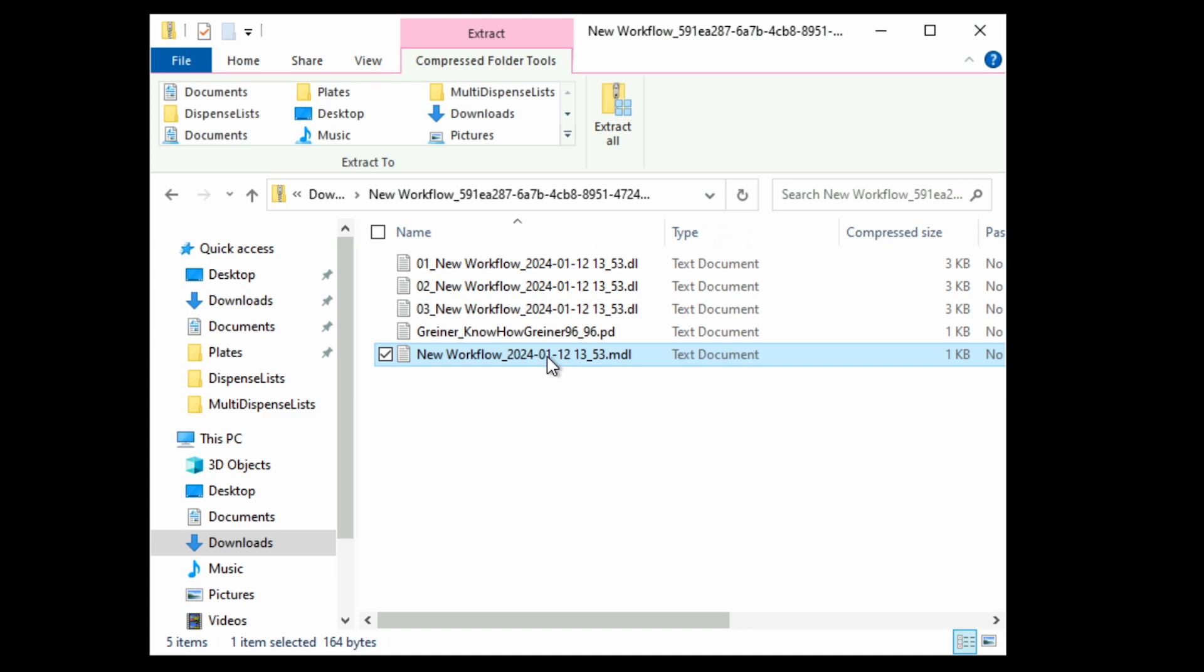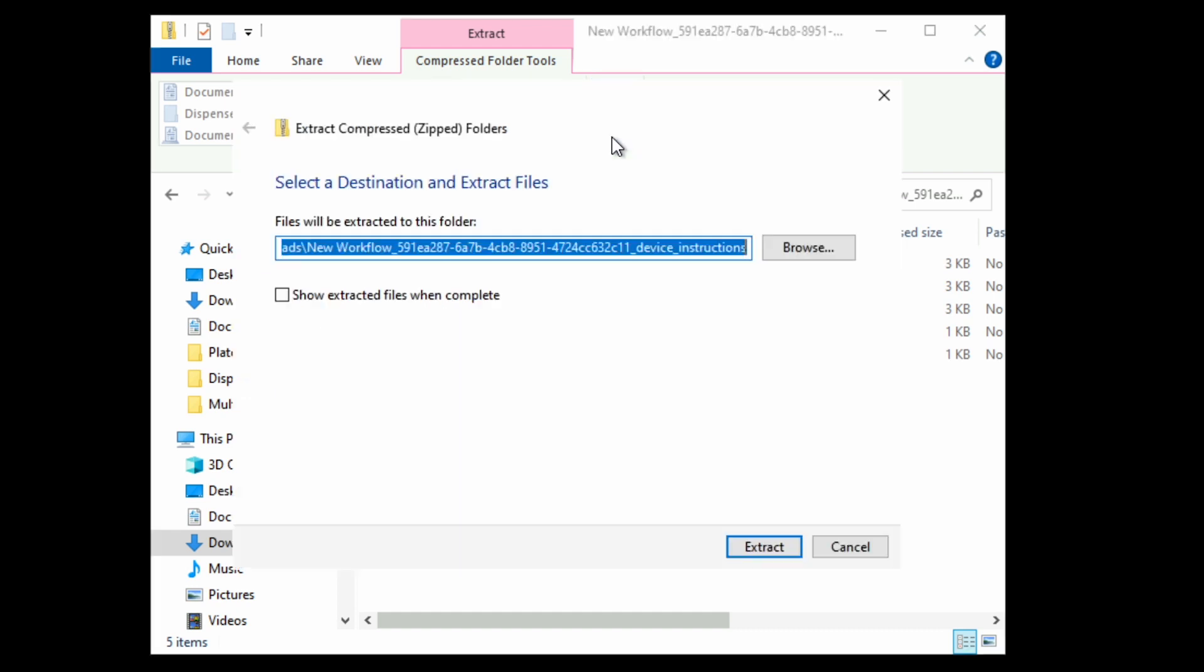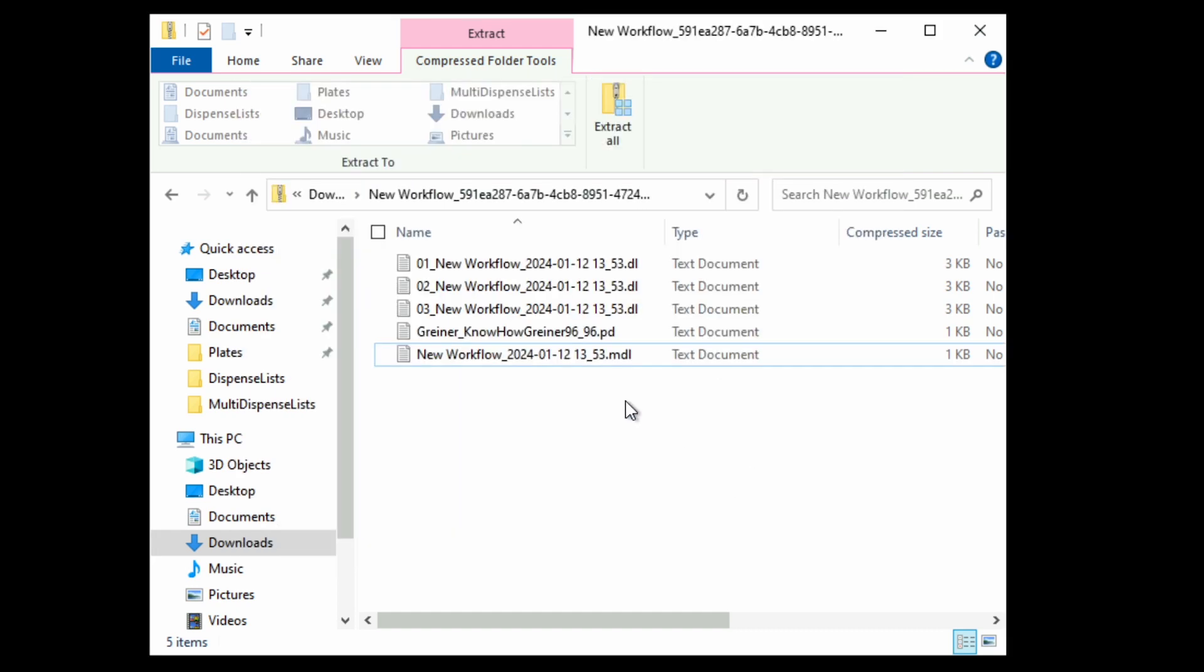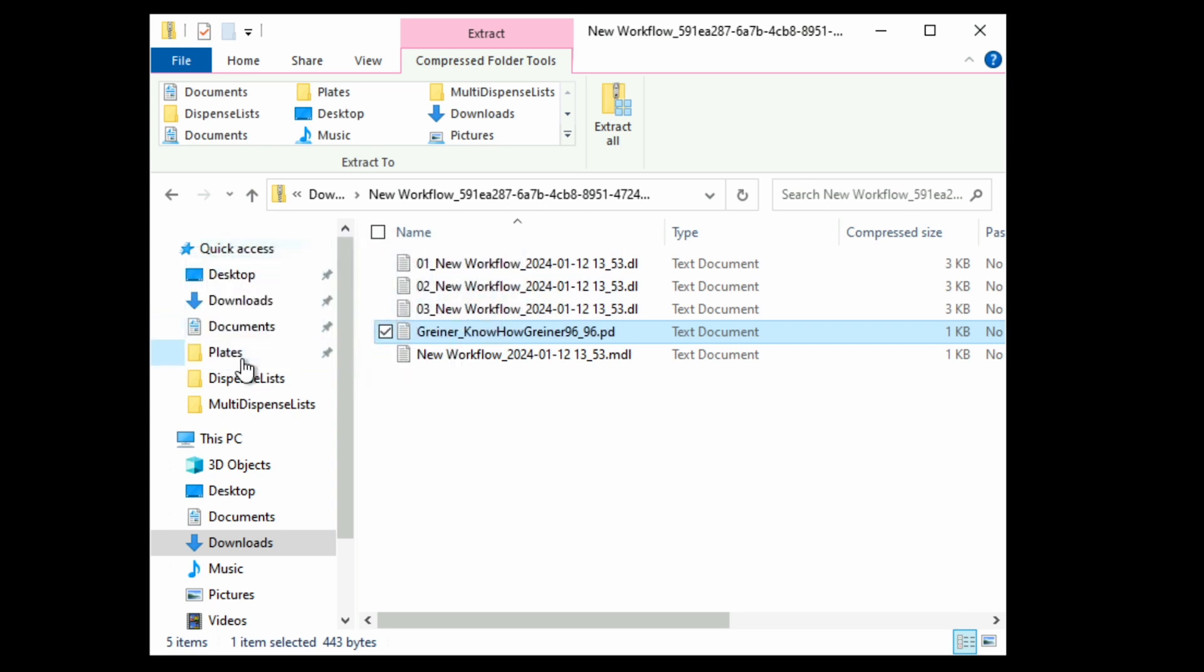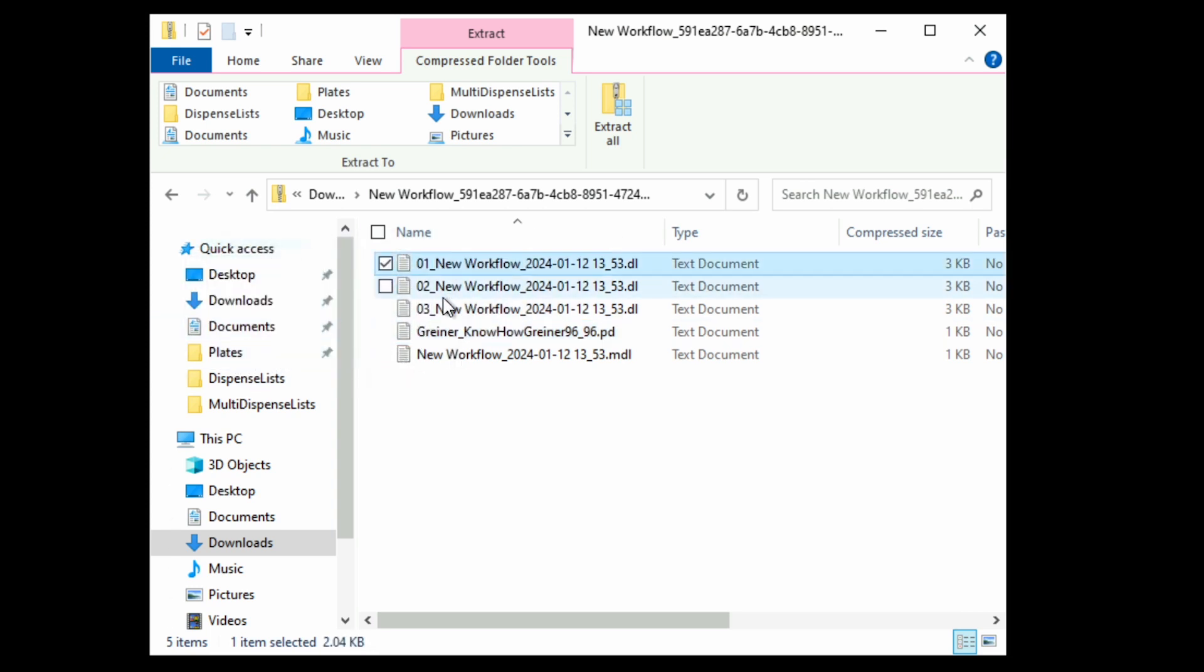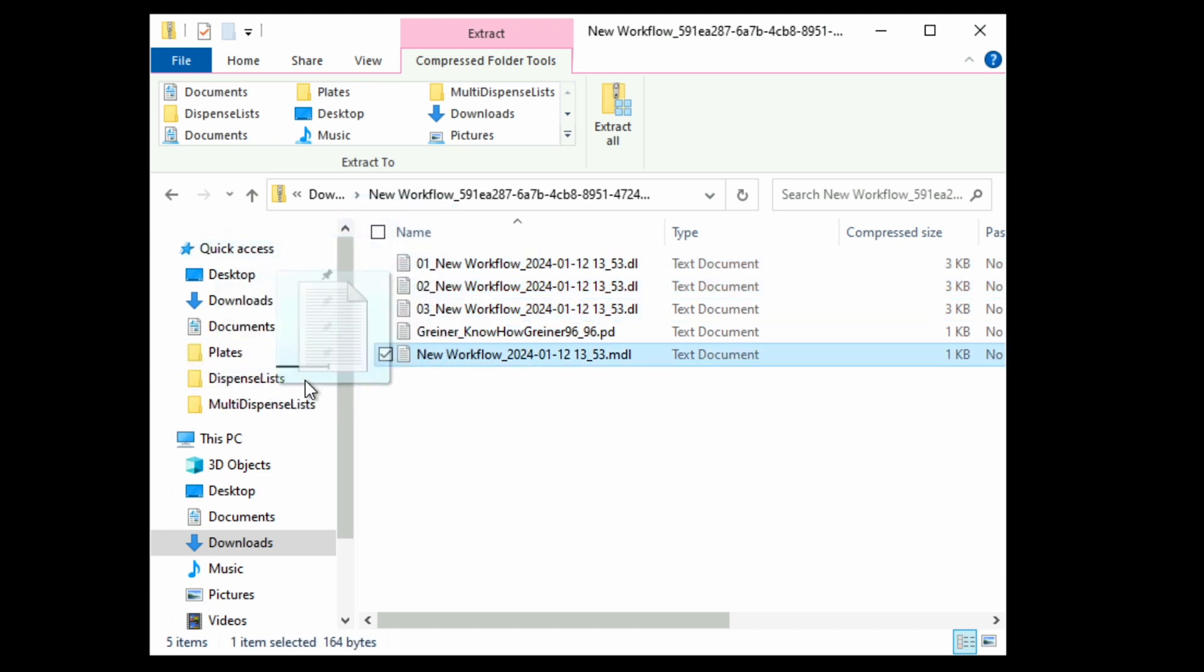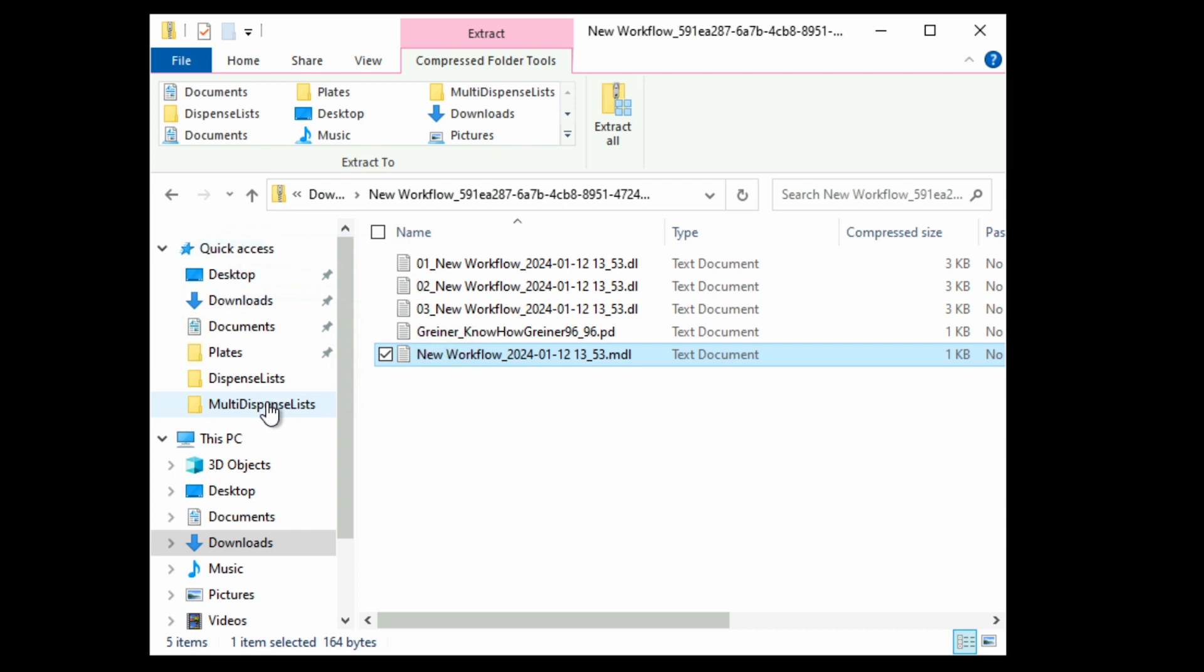First, you'll need to put these files into specific folders on your computer, so extract the folder to unzip it. Put all of the plate layout files into the plates folder, put all of the dispense list files into the dispense lists folder, and put all of the multi-dispense list files into the multi-dispense list folder. It's best not to rename files at this point, but if you do, ensure you don't delete the suffix.